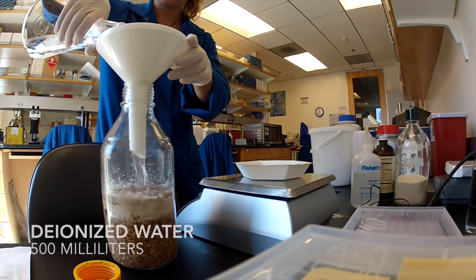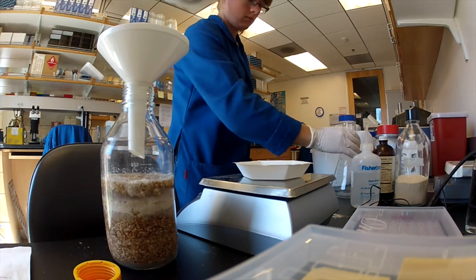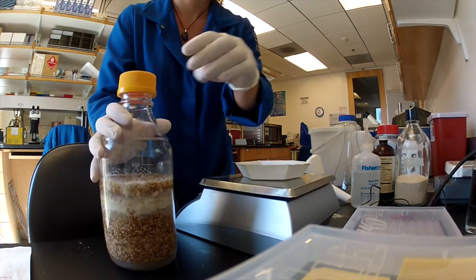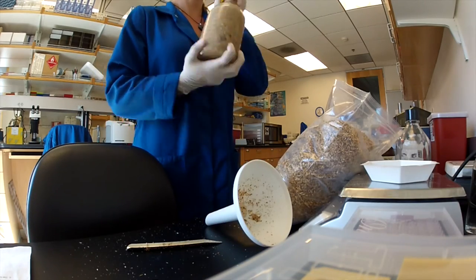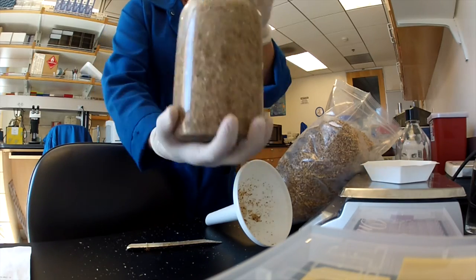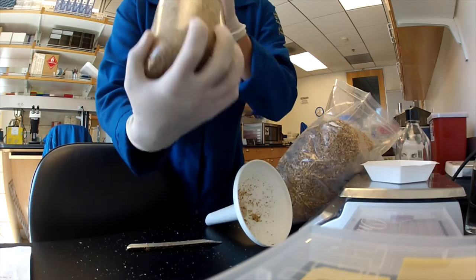The final ingredient is 500 mL of deionized water. After adding the water, shake well to make sure the diet is not too loose. If it is too watery, you may need to add more sawdust to prevent it from settling on the bottom of your tubes. This will ensure that your diet tubes have a uniform consistency throughout.